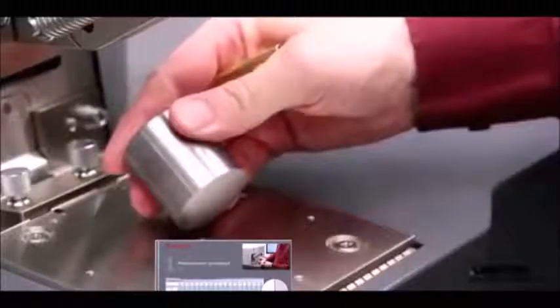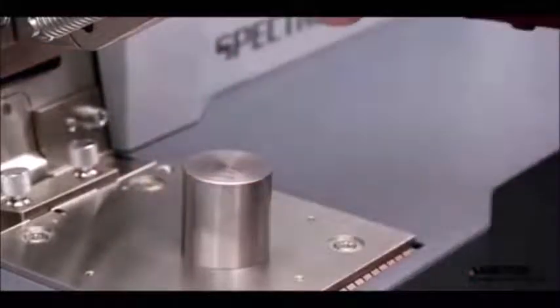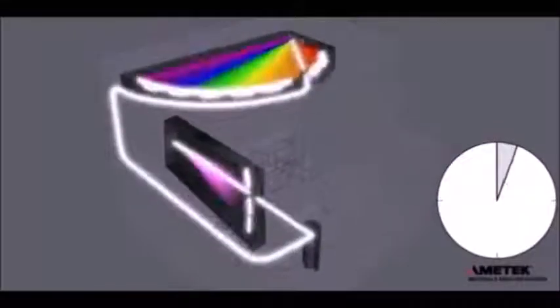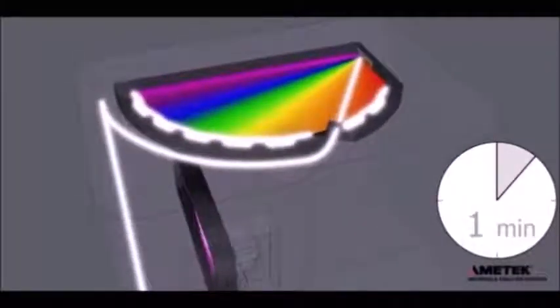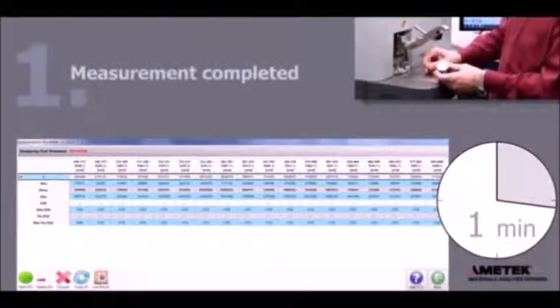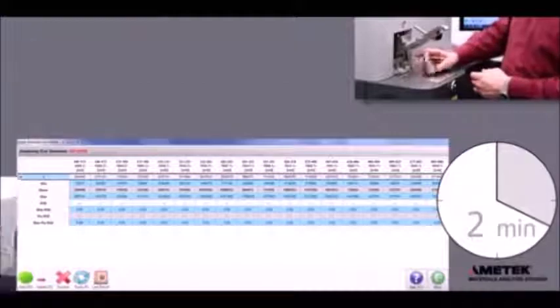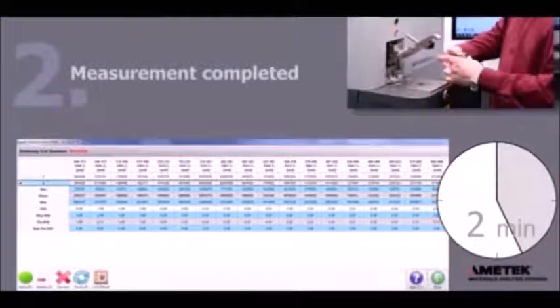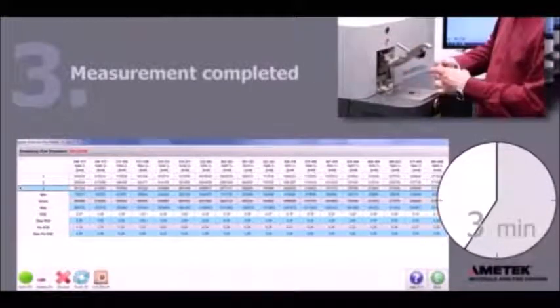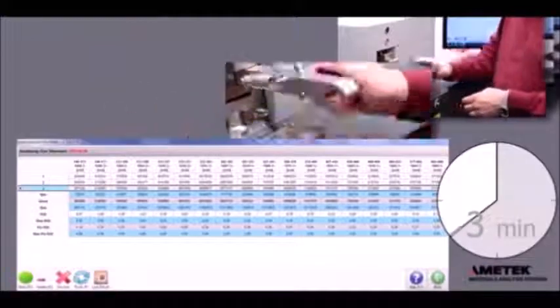So our samples are always solid, and that makes the accuracy of spectroscopic analysis drop to 1 to 10 parts per million only. Liquid samples can be detected to parts per billion, or even trillion, but for steel making 1 part per million is enough to achieve our product quality. The plasma consists of high temperature atoms, ions, particles, electrons, etc. We use a tungsten electrode with 2000 volts as a source of excitation. This will promote electrons in the plasma, making single atoms of all elements emit their characteristic line spectra. We detect it and obtain our quantitative and qualitative analysis.